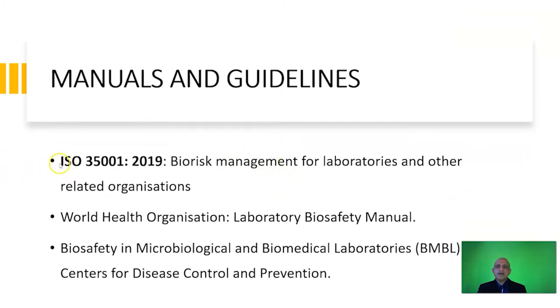To begin with, we have the ISO 35001:2019. This is a biorisk management standard for laboratories and other related organizations. This is a very useful manual for the development of your laboratory management system. However, you need to purchase this manual online as it is copyrighted. It's only 28 pages long, but you must reference the original text. I cannot distribute it as a part of this MOOC.